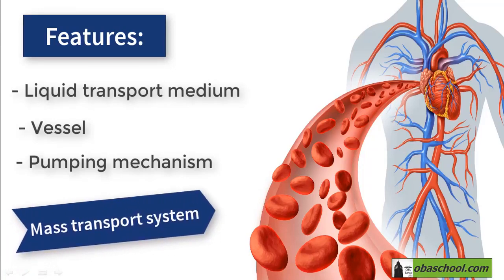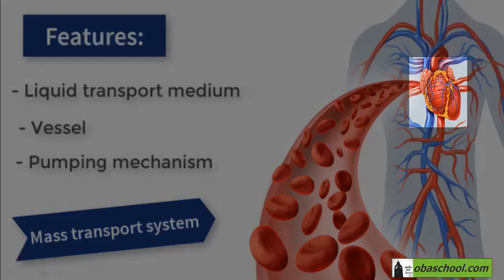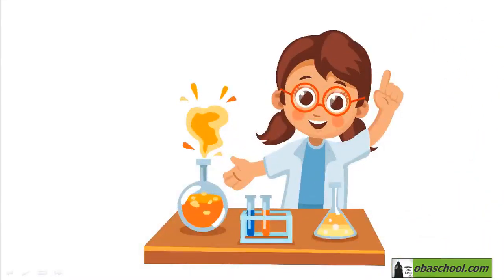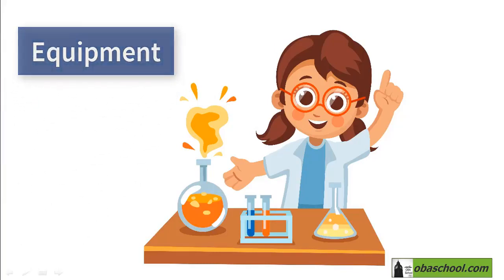Substances are transported in a mass of fluid with a mechanism for moving the fluid around the body, known as mass transport system. Can you tell which organ pumps the blood to the rest of the body? Yes, it's the heart. So let's dissect together a heart and examine its features. But first of all, we should ensure that all the equipment needed are prepared.